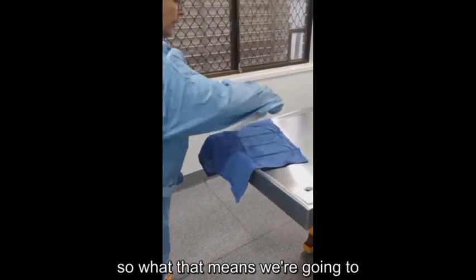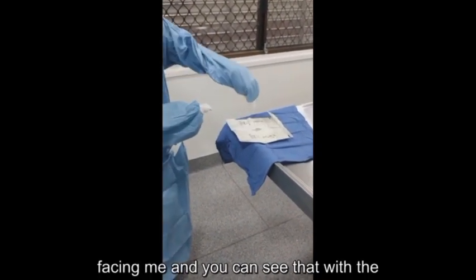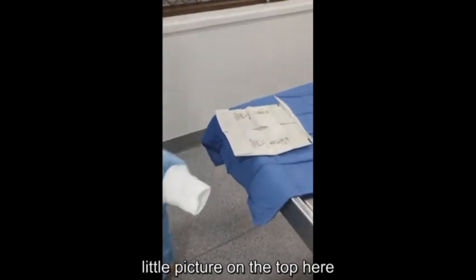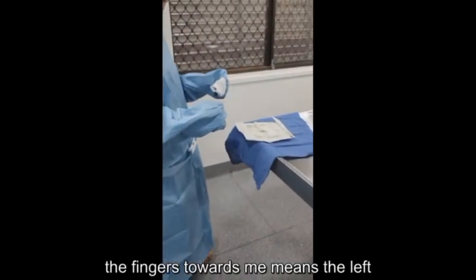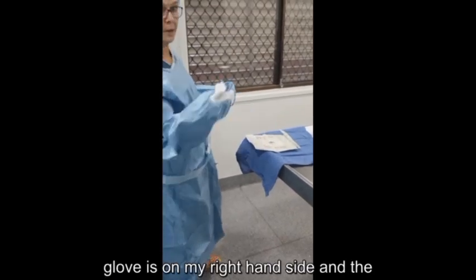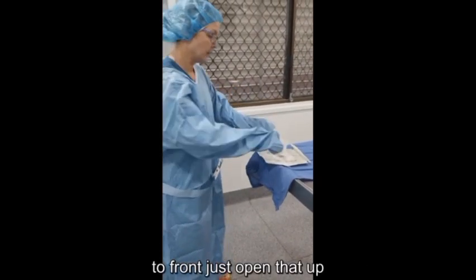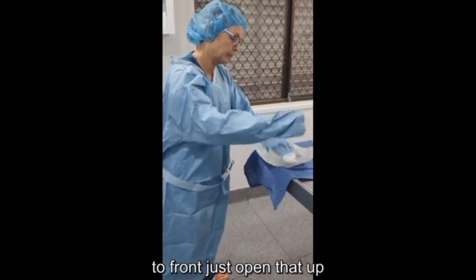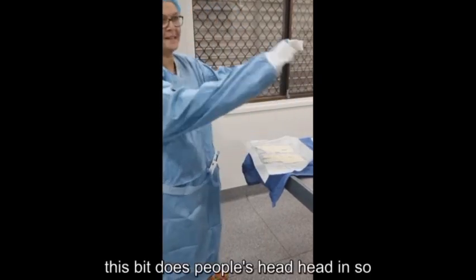What that means is I position the gloves so the fingers are facing me, and you can see that with the little picture on the top here. When the gloves are positioned with the fingers towards me, it means the left glove is on my right hand side and the right glove is on my left. So they're back to front. Just open that up. This bit does people's head in.